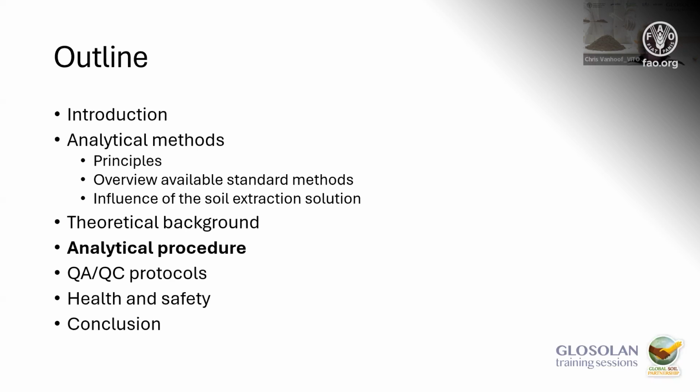Yeah, it's a lot of theory, but I think it's interesting to know how to work the pH electrode, what things you have to consider, and how you have to store or handle the electrode. I think it's important to know for later on in the lab, for the practical measurements. Yeah, I can remember them being quite delicate, and I guess this is the only instrument you have other than the extraction. So yeah, if you let it get really out of whack, then yeah.